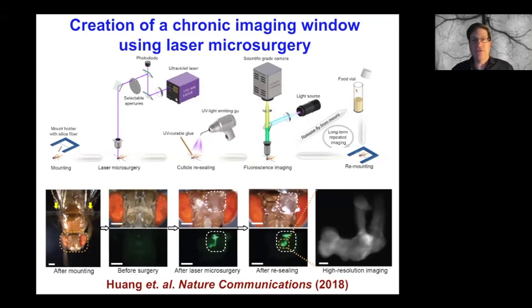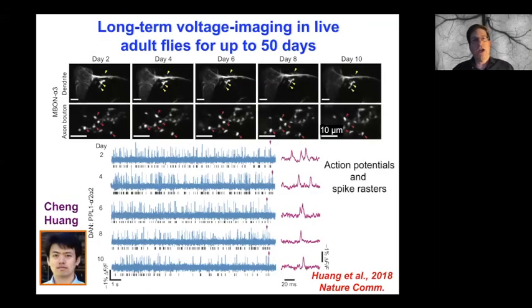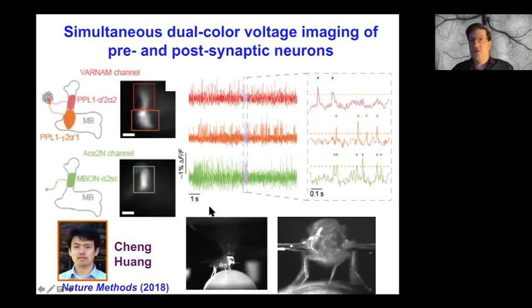And to give you a sense of what this looks like, here we can come back to individual neurons again and again over multiple days with these voltage indicators, imaged at a kilohertz, and track individual spikes. And in fact, one can do this in 2 different types of neurons at a time, which we hope will allow us to dissect the means of cooperation between different types of neurons.